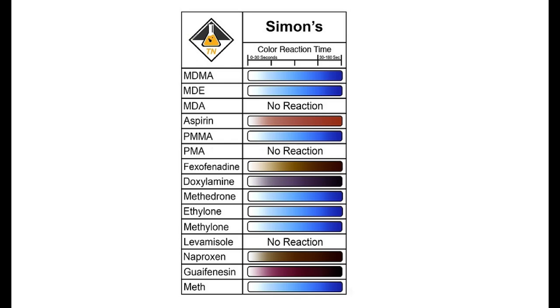If the acetaldehyde is replaced with acetone, the reagent can be used to better detect primary amines like amphetamine. In this case, the color of the product is supposed to be purple. Presumably, some mundane primary and secondary amines would give false positives. I don't know. There appear to be a lot of primary and secondary amines that don't react with it, so just be forewarned, it's not going to react with everything.